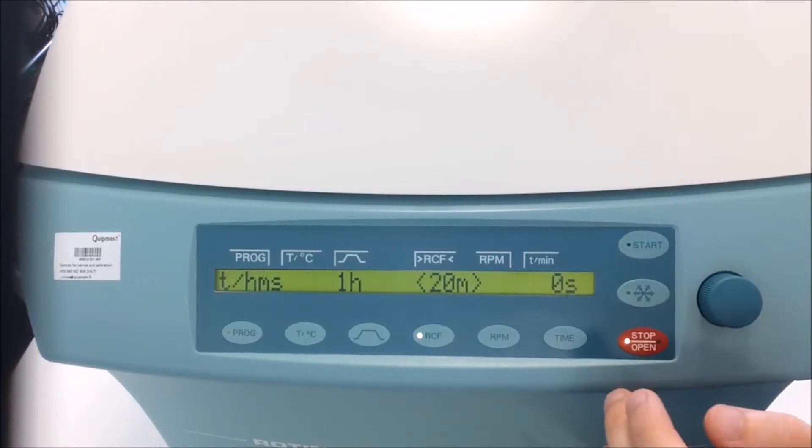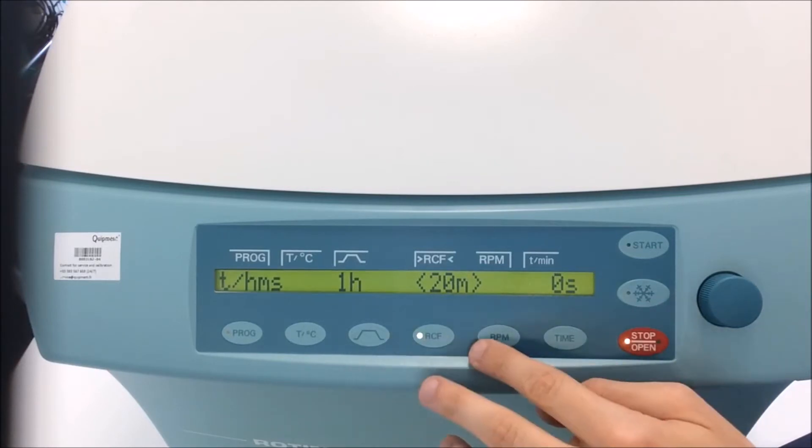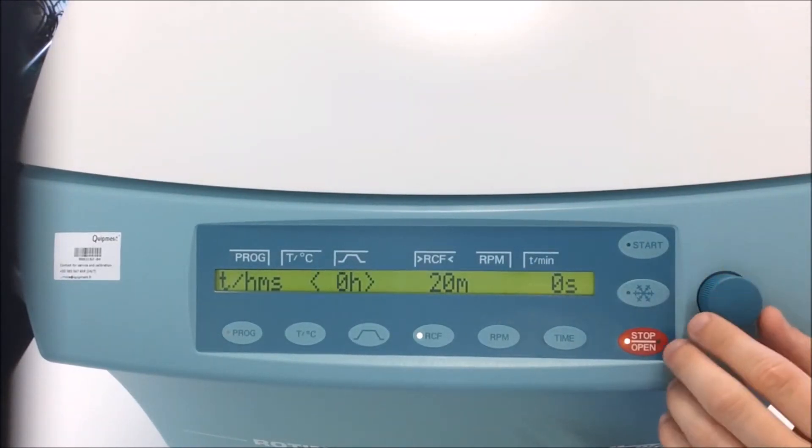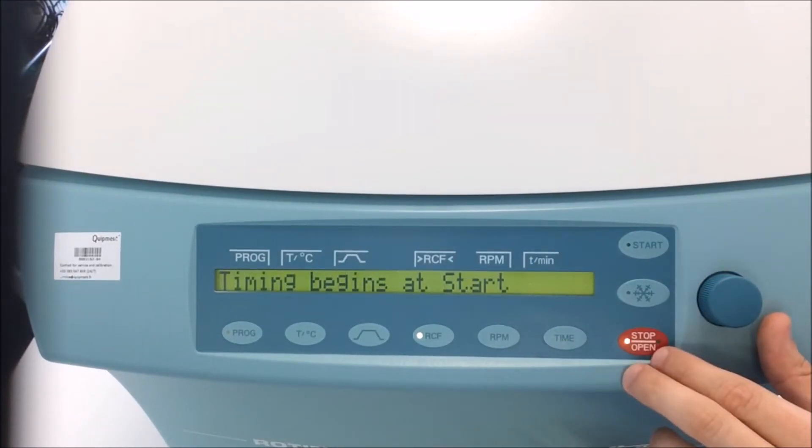And for the duration, I will switch between the units. You can just press on time for selecting seconds or hours. I will decrease to 20 minutes.